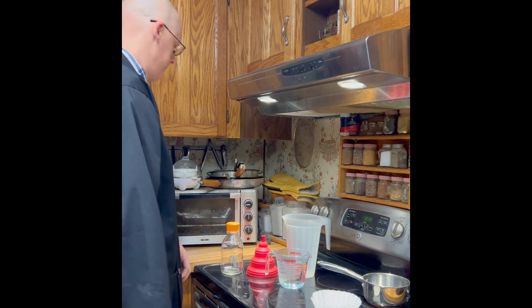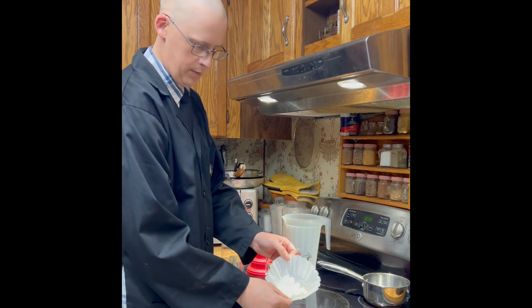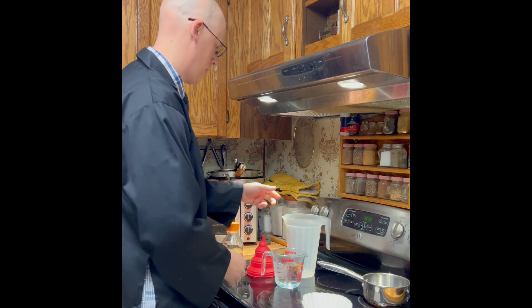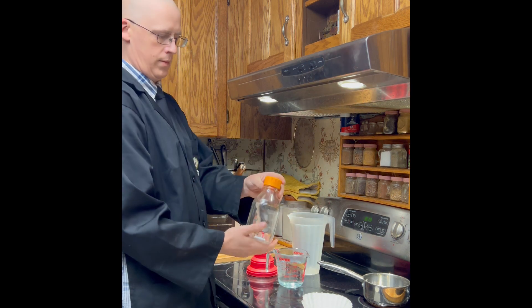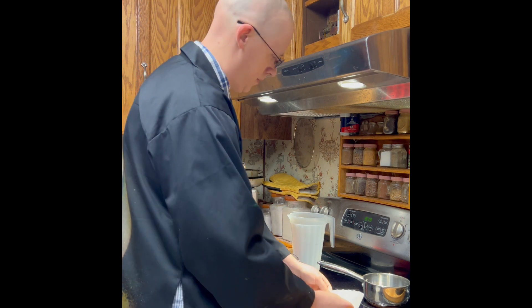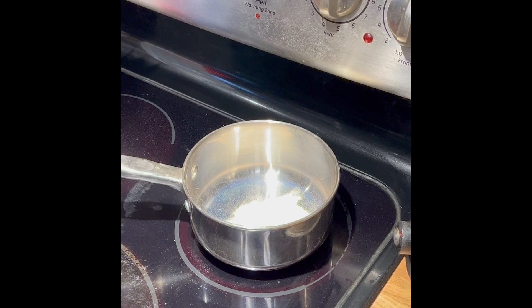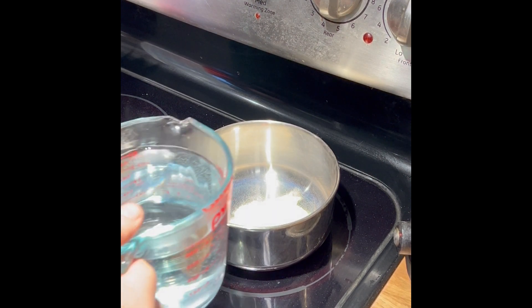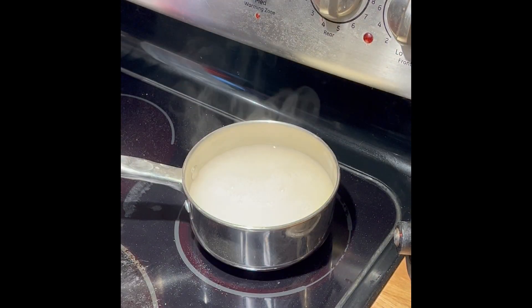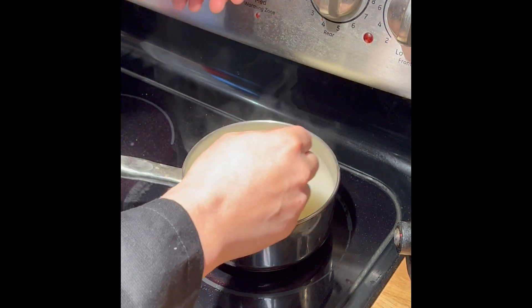Method two: stovetop. This one is more popular because everybody's pretty much got a stove. I've got my agar powder and my water — in this case it's a little bit hot — along with some extra tools for pouring into our media bottle. You'll notice I don't pour the water in the pot first; I pour in the powder first. The reason is I'm kind of cheating and using hot water to speed up the process. When I add the hot water, the agitation from the pouring actually mixes it up, and then I grab my fork and mix it up.